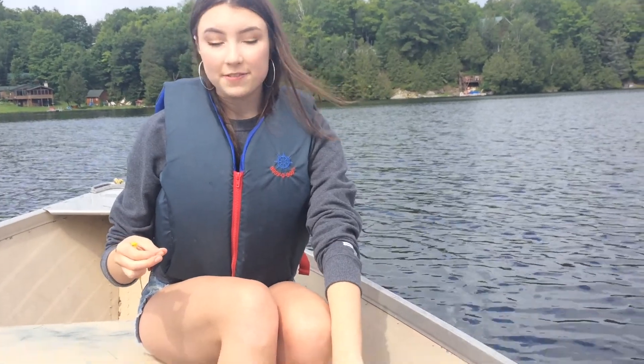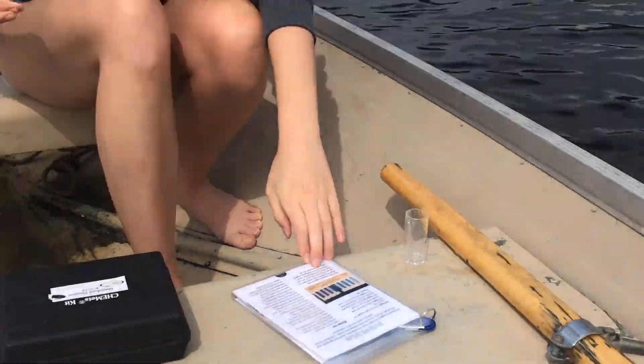Page 19 of the field guide has everything you need to know about the dissolved oxygen kit, so every piece of information you'll need will be there as well.